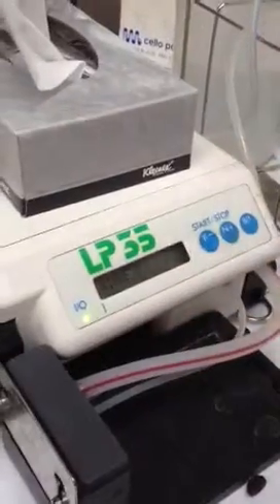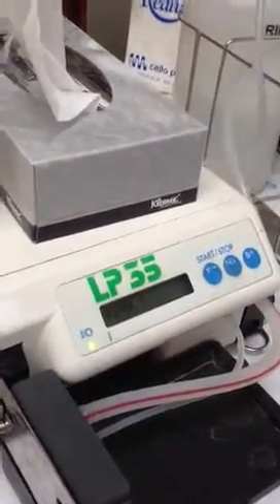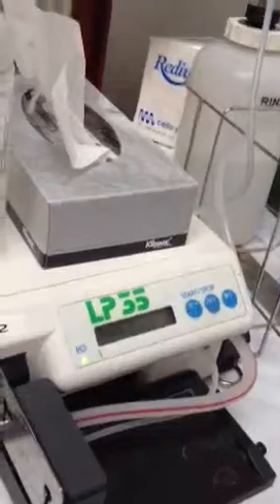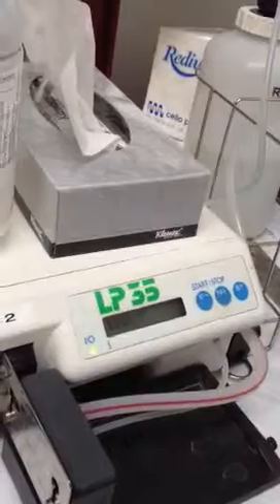Rinse is something you need to do between buffers and water — so always have a rinse. The rinse is always water usually. And then you've got your buffer. So if you're changing buffers or at the end of the day, always rinse. Because if you don't rinse, the salt will just precipitate in the lines and block the lines.